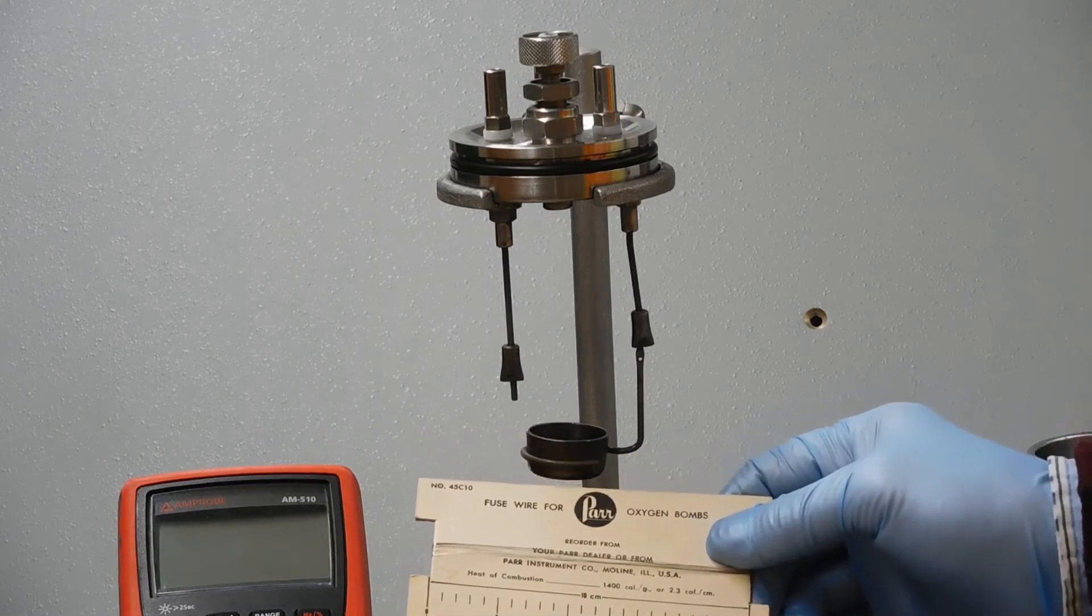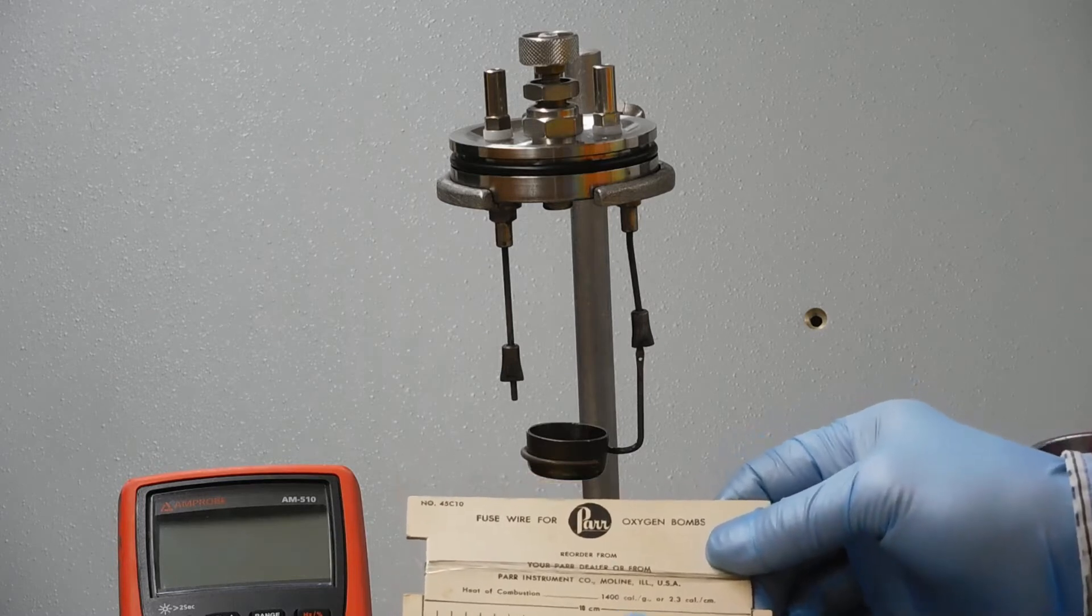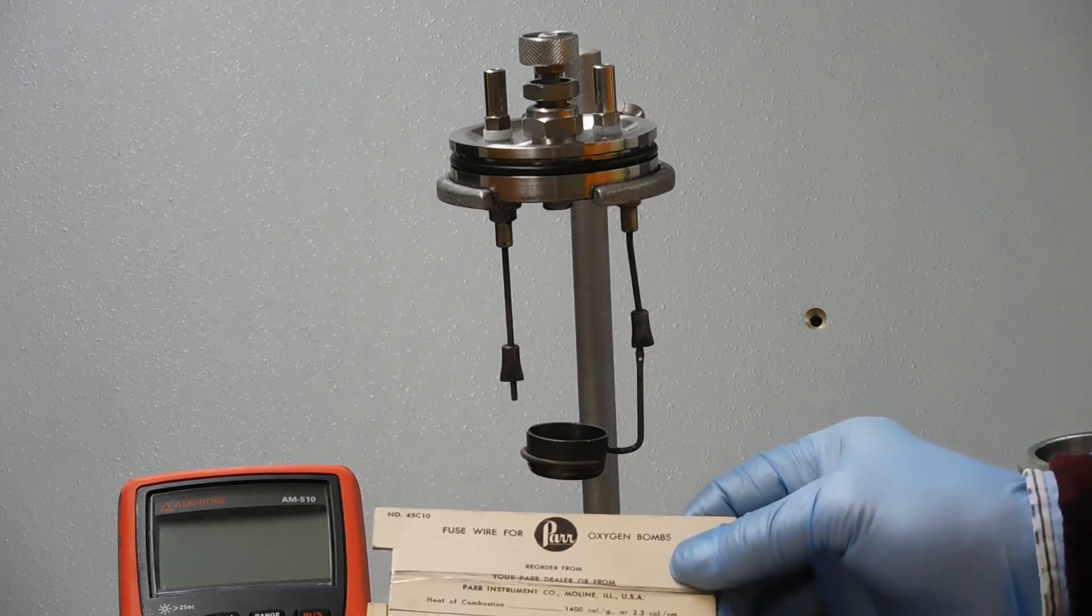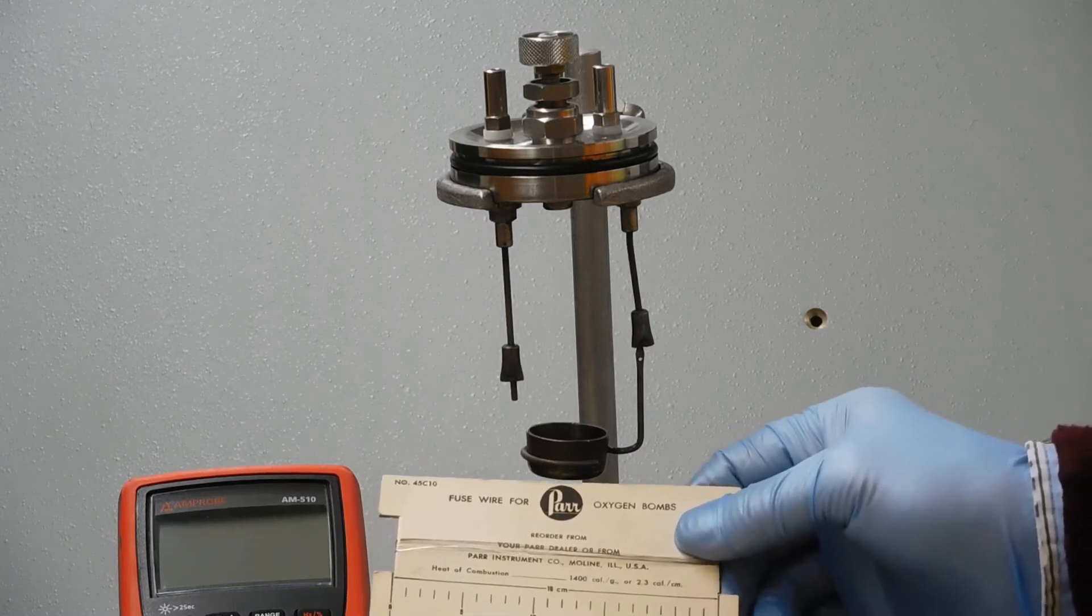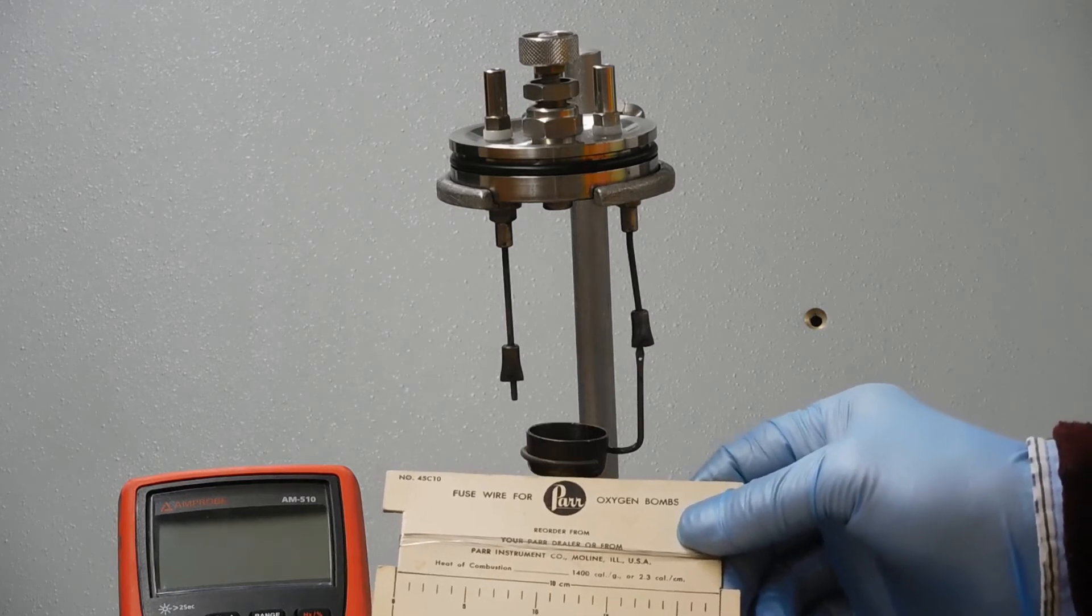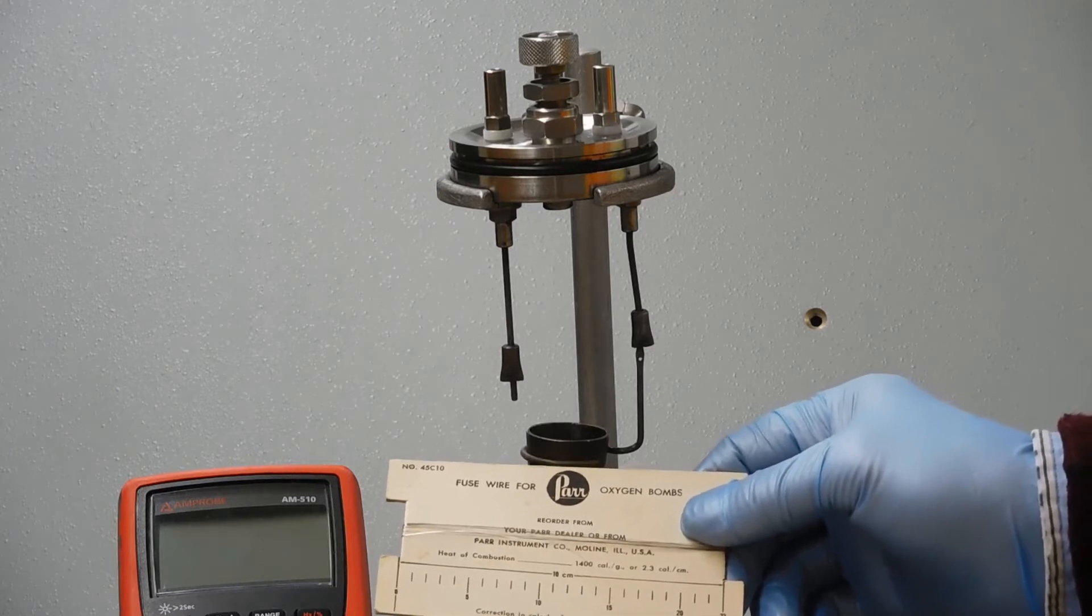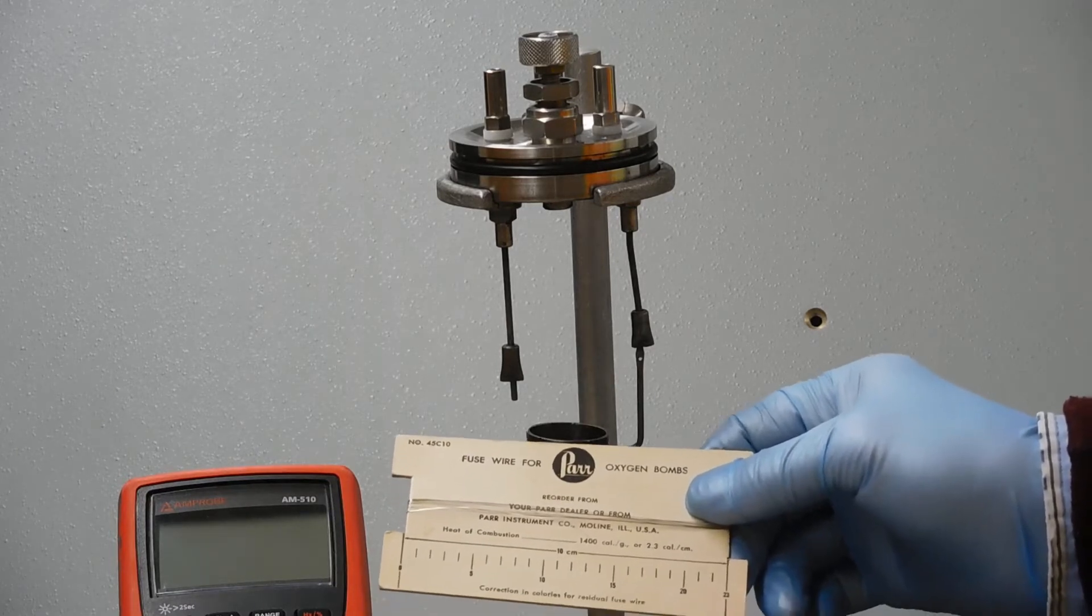This is how the fuse wire comes - it's on a card. On the card it says how much energy is generated by burning the fuse wire, because some of the wire will be burned in the process too. You'll collect what's left over and weigh it to figure out how much was actually burned.